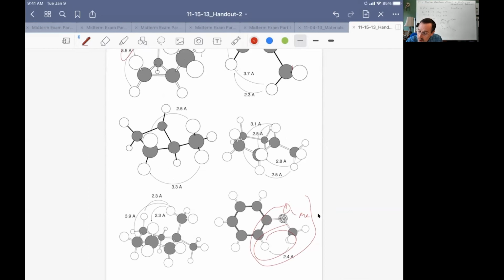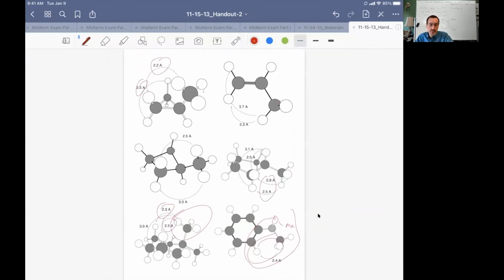Here's a methyl group in the equatorial position on a cyclopentane envelope. And you'll notice that the cis and trans differences aren't very big, so you really have to be careful. Here's an axial methyl on a cyclohexane ring where you're getting nice, strong 1,3-diaxial interactions. So that's a little bit of an example, but in general, you're going to want to make some models and really look at these yourself rather than relying on just a paper and pencil drawing. It's a good way to go.